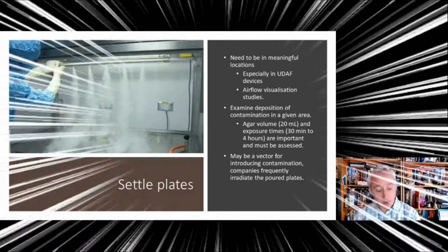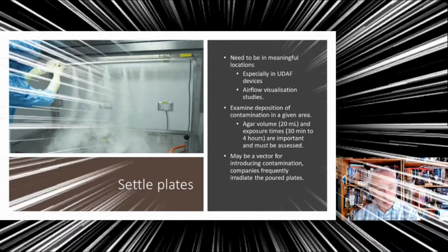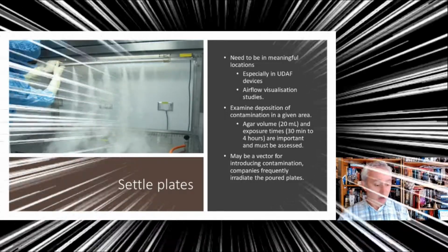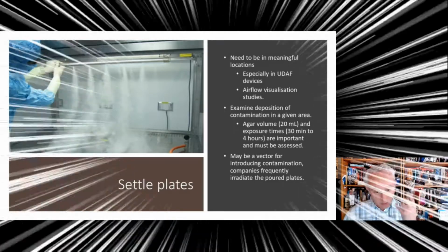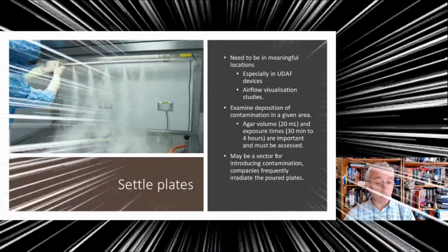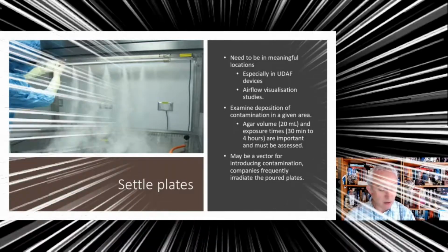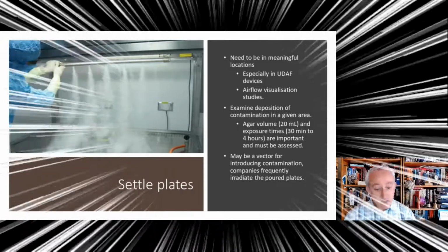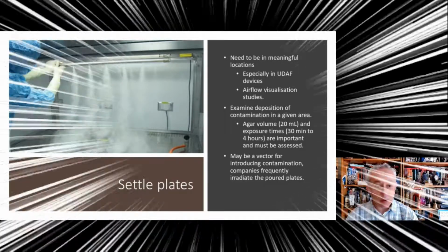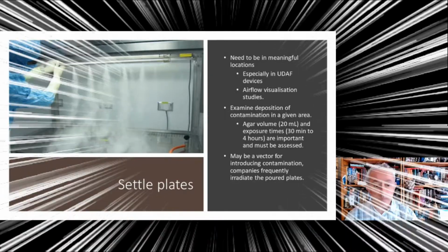But we also need to know that the agar can function effectively in these harsher conditions, because remember, air within unidirectional airflow devices is very fast, and it can dry out the agar quite quickly. So we need to show that the plate can be exposed for 4 hours whilst retaining its nutritive properties, and there's discussion about that in the material. We also need to be careful that when we put plates in and out of a unidirectional airflow device, we're avoiding cross-contamination as well.